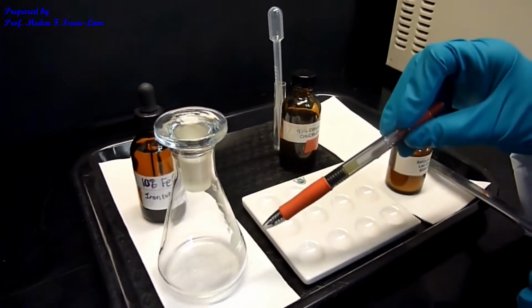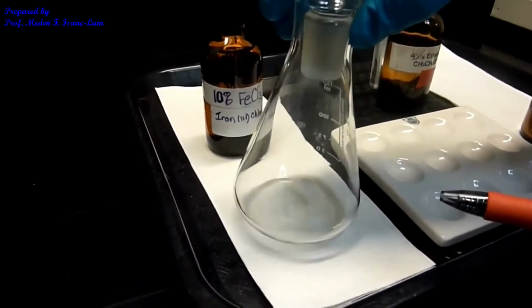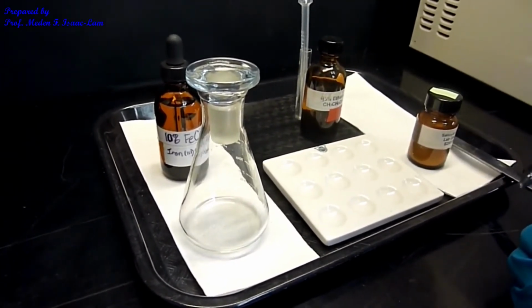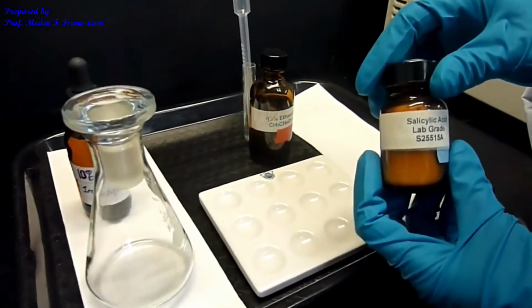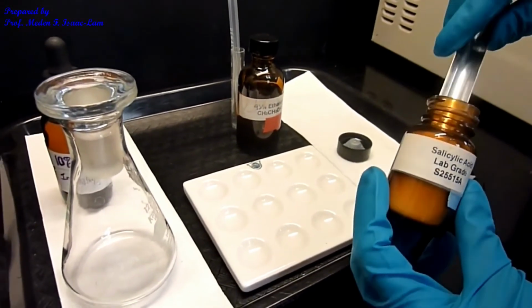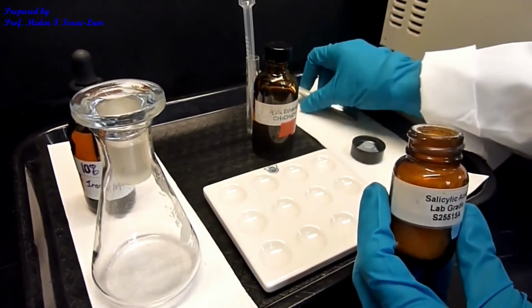After 8 minutes of microwaving, I now took out the sample from the microwave, and I have a little bit of a liquid at the bottom. And I will check for completion of the reaction by using what is called the iron 3 chloride test. So I will compare it with the starting compound, which is the salicylic acid. And I will put a little bit of that sample in one well in the spot plate. So just scoop a little bit. So I'll put it in that well.